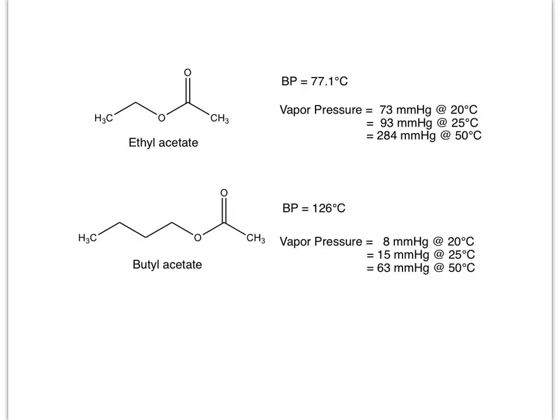The molecules we're going to be separating are ethyl acetate and butyl acetate. If you look at this structure in both of them, it makes them esters, right?